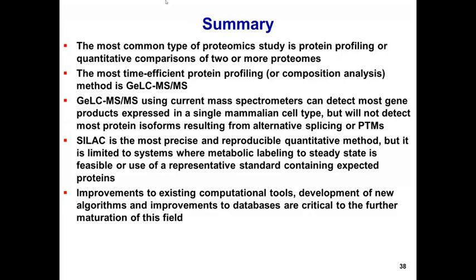SILAC is the most precise and reproducible quantitative method, but it's limited to systems where metabolic labeling to steady state is feasible, although one can use a representative standard, such as a mixture of cell lines, to analyze a human tumor.